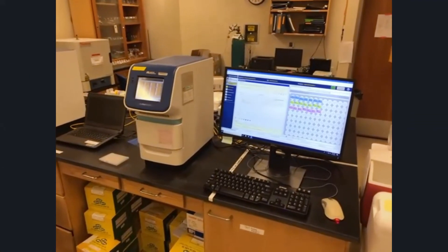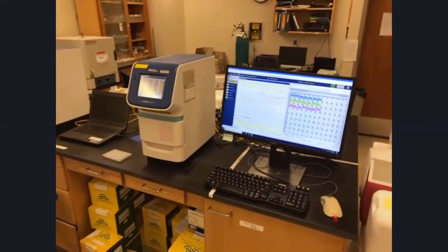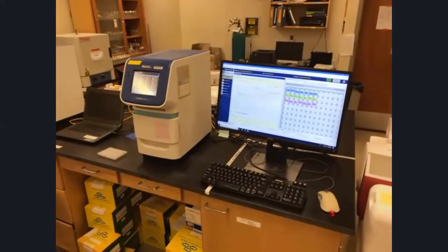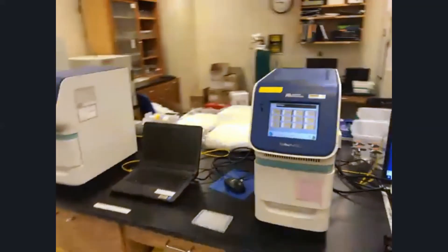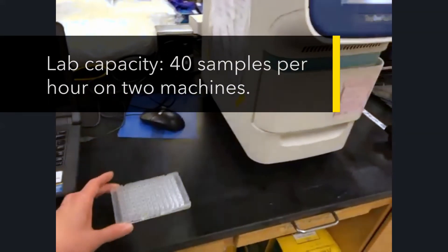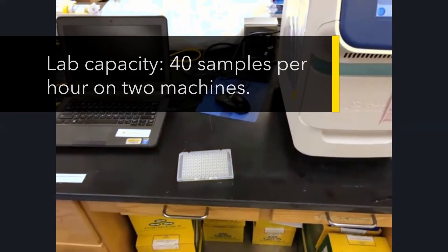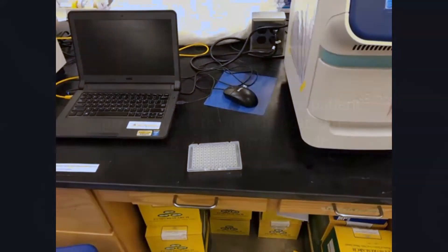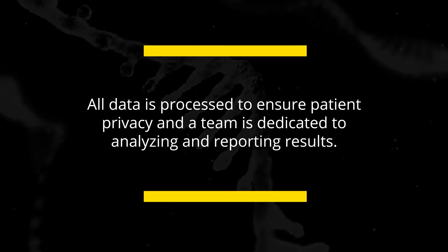The goal with this is that we have the ability to measure bits of RNA that are in very low concentrations by making many, many copies of them. Once the sample comes up, we load it into one of these small plates, which has 96 different wells on it, allowing us to test a number of different sample types in a single plate — up to 20 samples per plate.